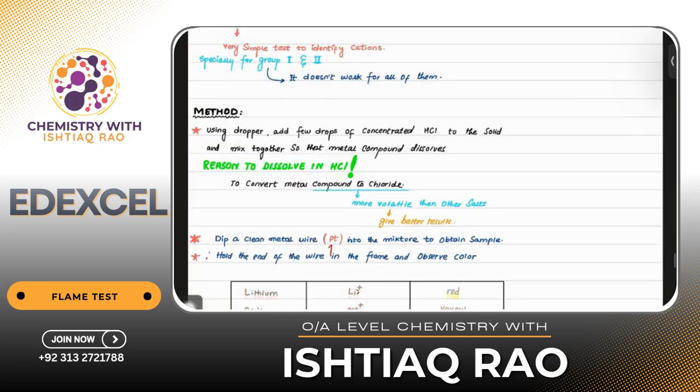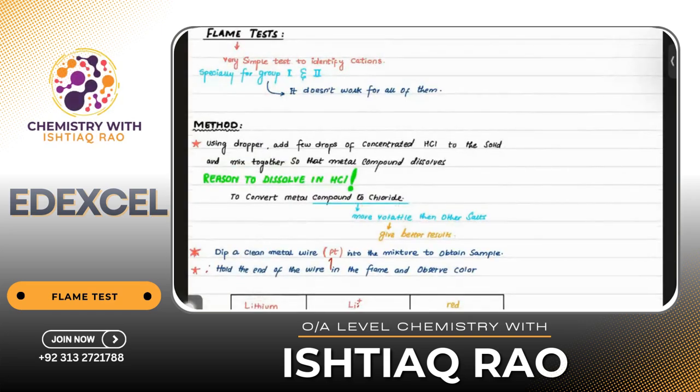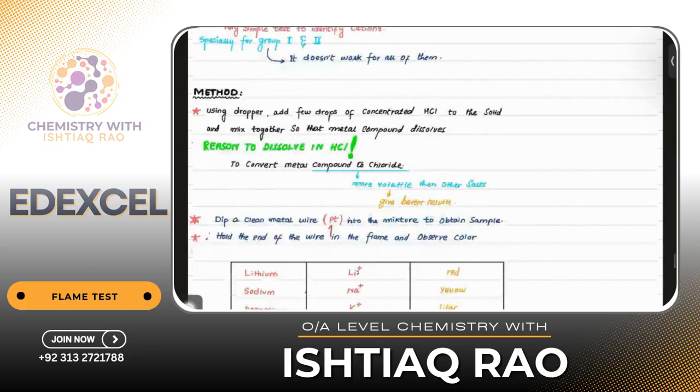So according to the specification in group 1 and 2, we have a flame test. The flame test is used to identify the presence of cations, what type of cations we have. Basically, this flame test is specific for both group 1 and group 2. Also, how can we do a flame test? What's the method? What's the procedure?